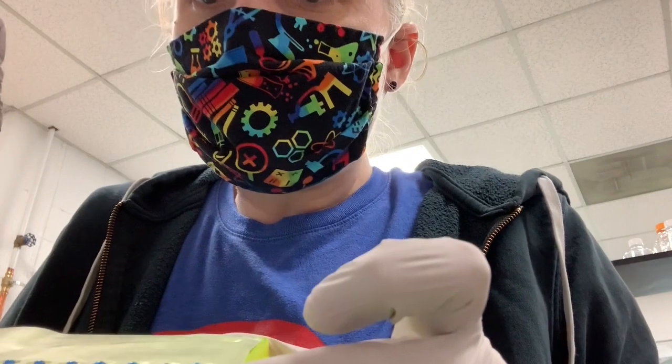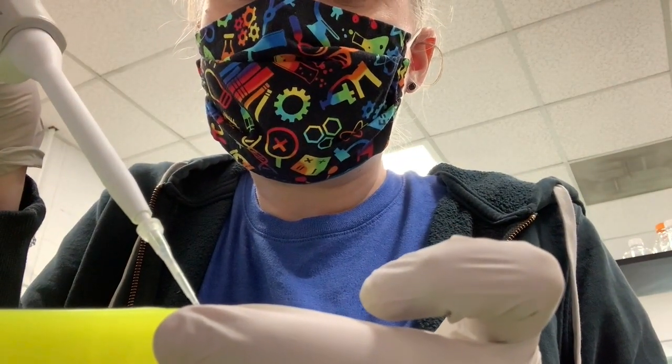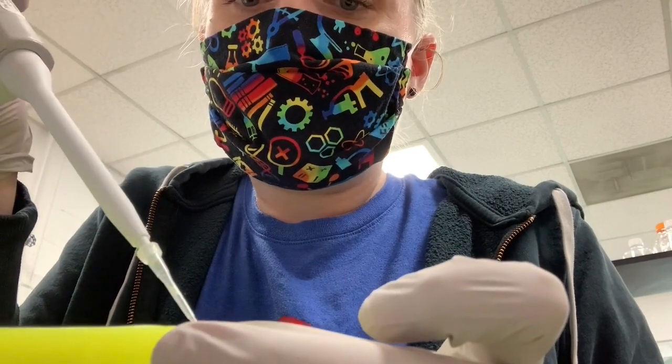And then the last step is to take 1 microliter from your dilution and put it in the loading dye. So let's see if I can angle this so that you can see it. So I'm going to take my first microliter from my top left dimple, and I'm going to move it into the blue dot below it. And then I'm going to do the same thing for each of my other samples. I'm going to use a fresh tip with each of these because I don't want to contaminate one of the samples with the other double-stranded RNA.